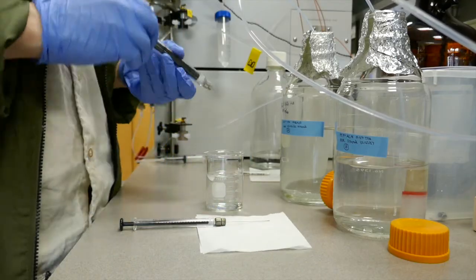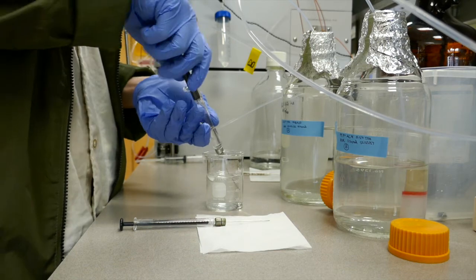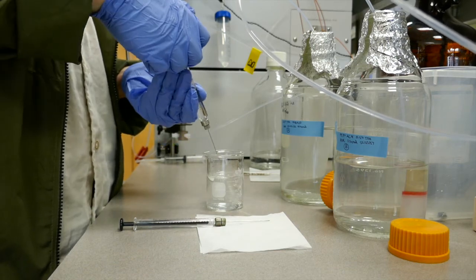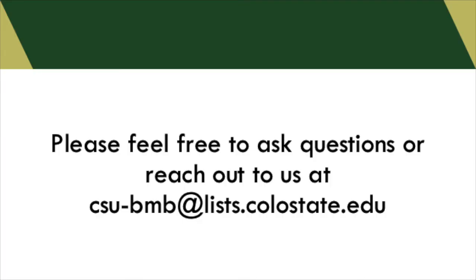Last, we got to make sure that we clean out our syringe, so wash it out with water and store it from there. And that's how you run an HPLC.